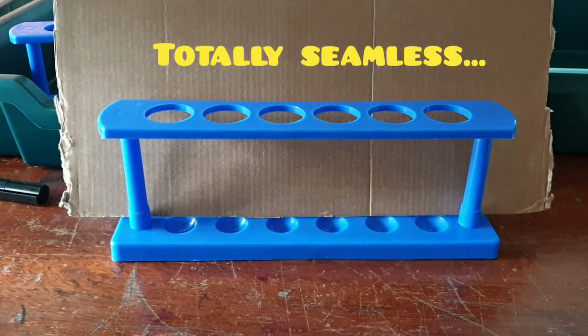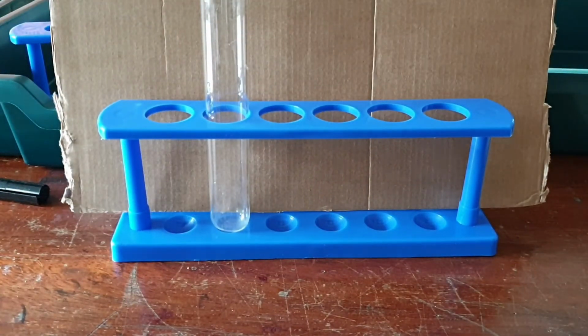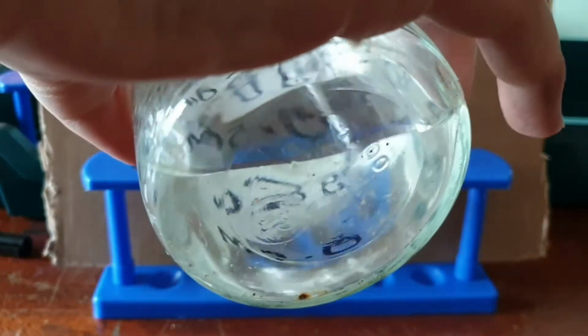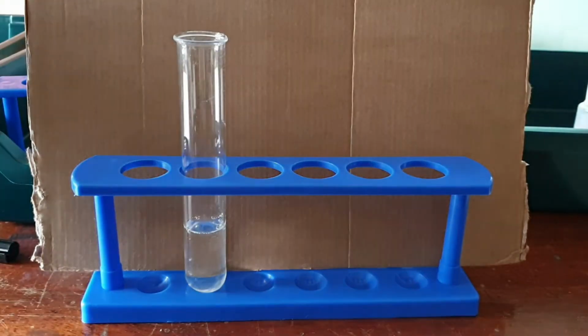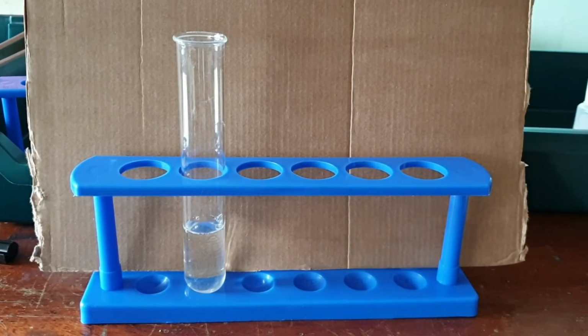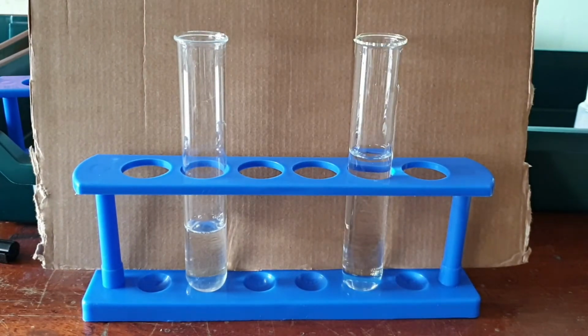Right. So our unknown mystery compound. Pour it in. What I will do actually, I'll get two unknown mystery compounds. Ignore that, it was a tap running. This mystery compound definitely isn't water. Right. Okay.